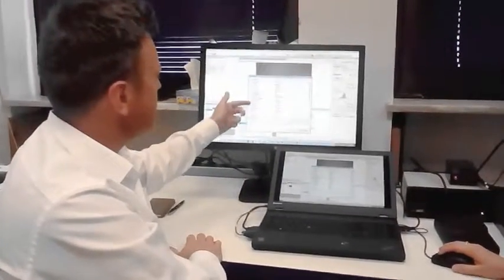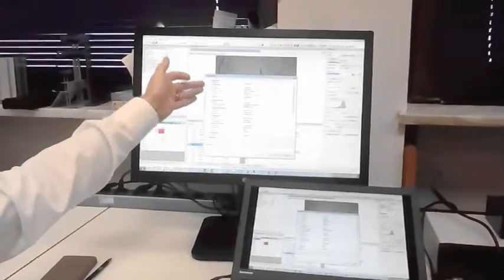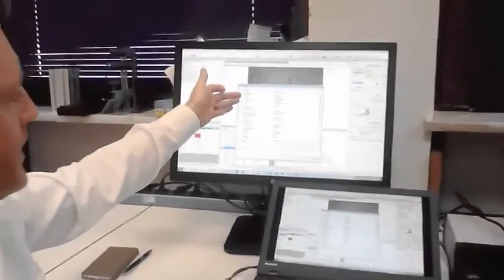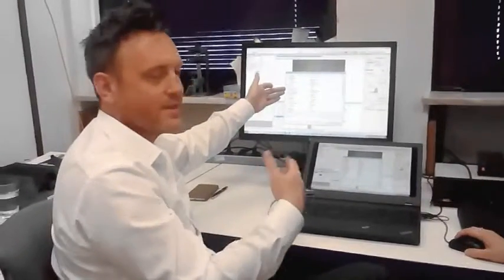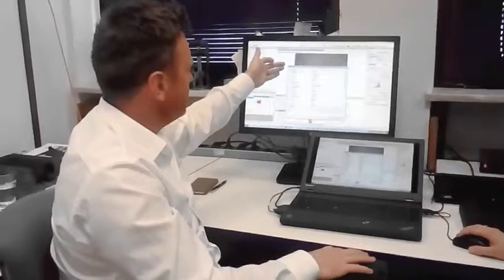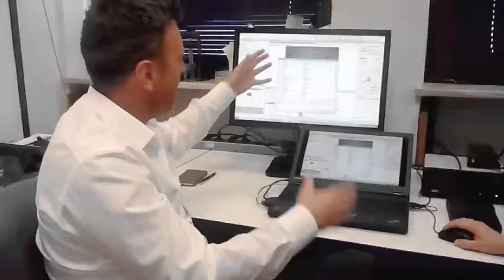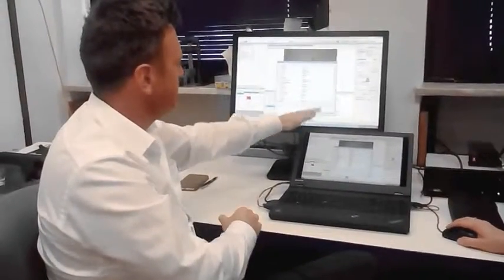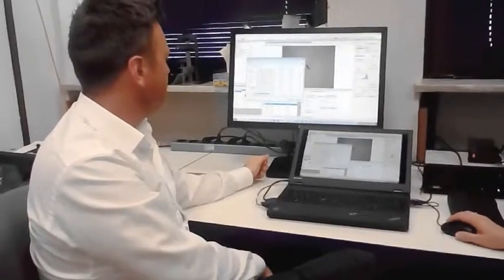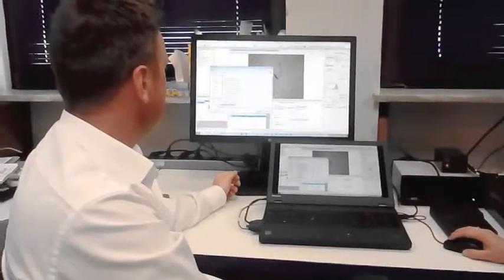So in here, if you wanted to as well, in the report that Karen's selected here, there are a number of different fields, and these are all customizable by a user. So it, for example, might have your customer's name, your order number with him, and all kinds of other things relating to your order with your customer. And it might be an operator, it might be the username and this kind of thing. Anything that you wanted to be included on a quality report. So once you've filled all those in, just confirm. Hit the OK button.